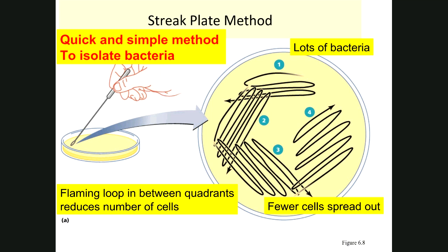When you proceed with this technique, you need to follow aseptic techniques. With a sterile loop, you're going to pick a sample of bacterial growth from either a plate, like they have it here, or from a broth or from a slant. Then you're going to come to the new plate, where you're going to streak for isolation, and you're going to streak one side of the plate with close together streaks. Then you're going to flame the loop again to kill whatever organism remains on the loop.